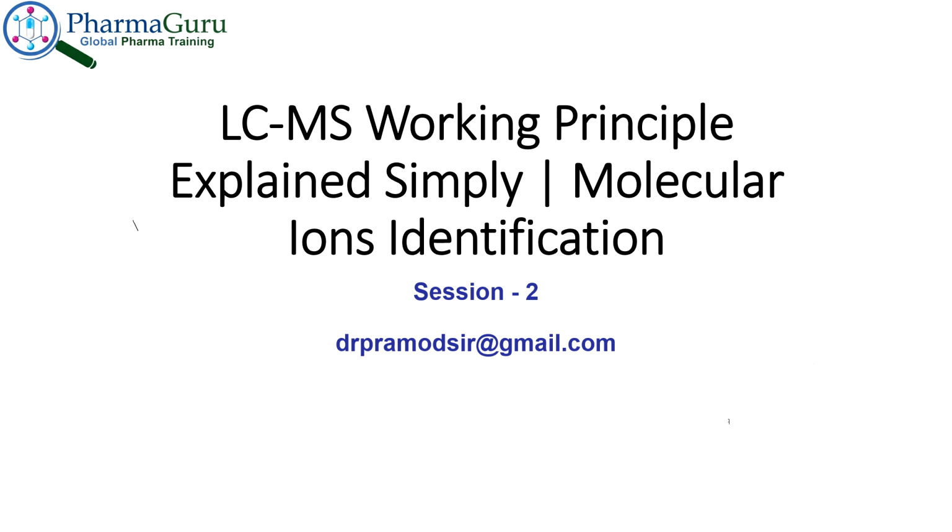Namaste. In this session, I will teach you LCMS working principle, molecular ions identification, and molecular mass calculation.